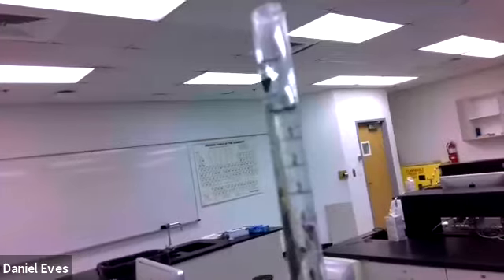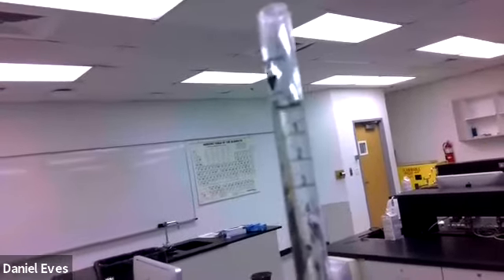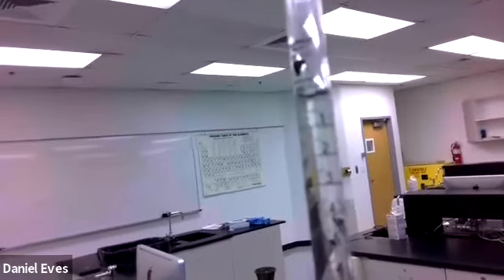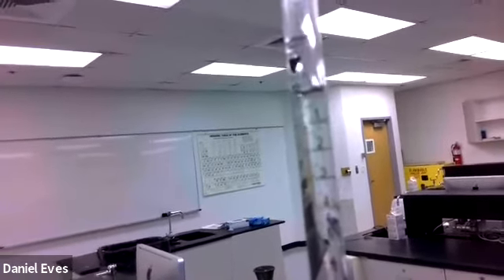We went from a 0.1 to 27.15 milliliters for that first one. And we're going to set up for a second one. Okay, this is me holding it up so you can see it. The burette is at exactly on the 0 mark. So we're just going to go based off of that. And we have our second solution of the potassium hydrogen phthalate. And we are going to titrate it again.